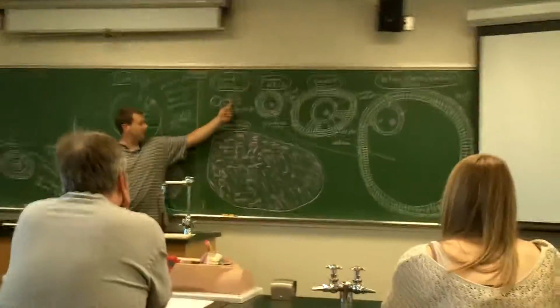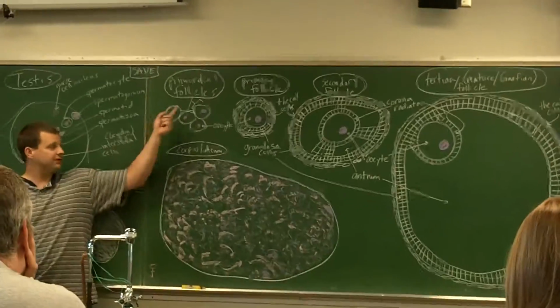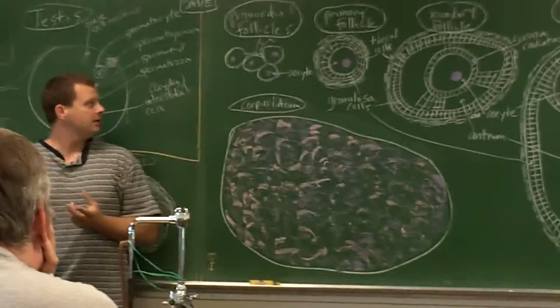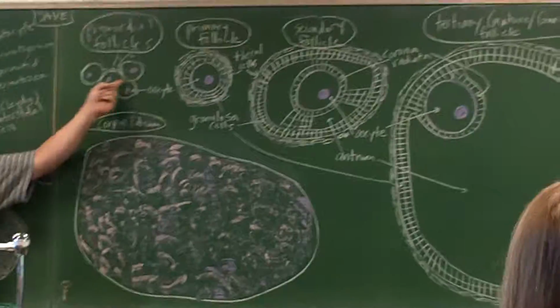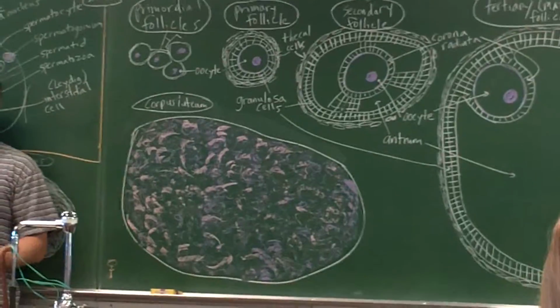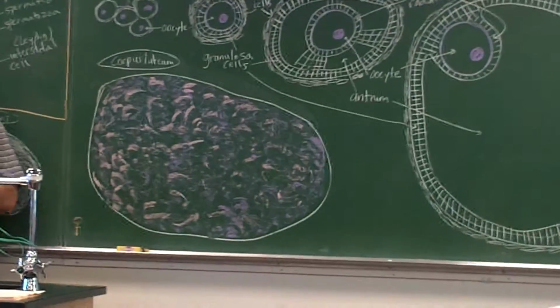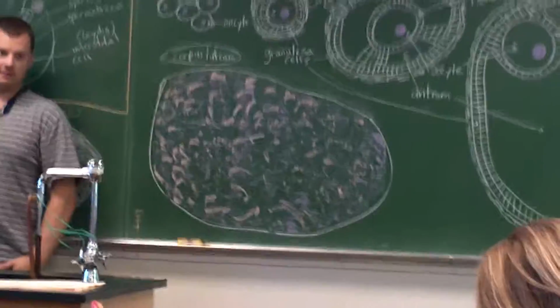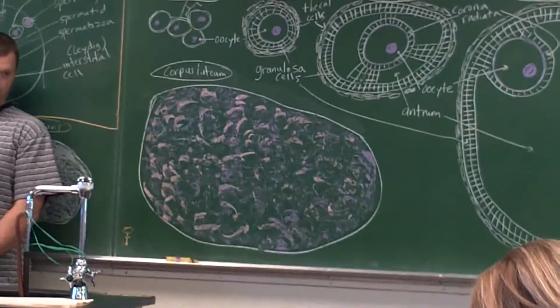There's an oocyte, which makes up most of the follicle, and then there's just a few squamous-looking cells surrounding the oocyte. So again, there's an oocyte and a few cells together. Together, the oocyte plus the surrounding cells make up the primordial follicle. They tend to be found in groups called egg nests, which you'll find just inside the outer wall of the ovary.